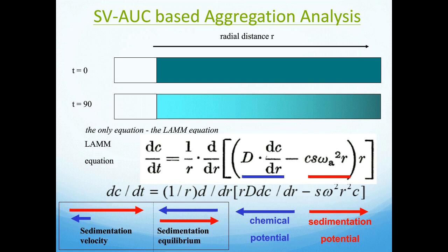So basically, you can rewrite and reorder this, and you're looking at the difference between the chemical potential, which is, if you like, what keeps samples in solution, repels them, keeps them from each other, and the sedimentation potential, which is, if you like, what attracts molecules to each other, and then they can degrade that way. Obviously, the sedimentation potential is also affected by the centrifugal force that you put on it. And in this case, when we're talking about sedimentation velocity, we have a higher sedimentation potential than we do a chemical potential, which is why the molecules pellet at the bottom of the cell.